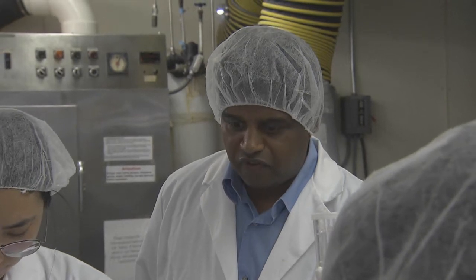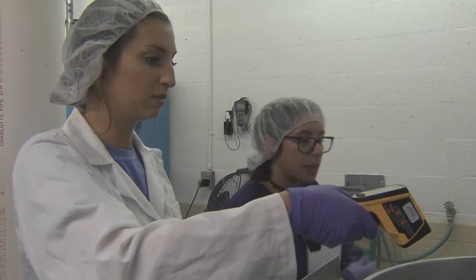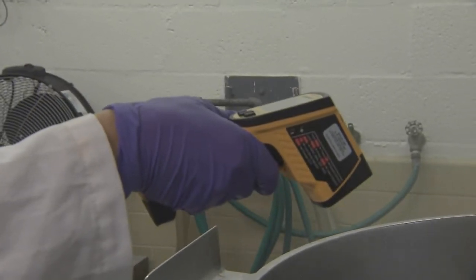Subramaniam Sativala, food processing and engineering professor, teaches the class which he says prepares the students for the workforce. The students work with equipment found in the food industry and use techniques that are employed in the food science profession. Once they learn from here, they can easily adapt to the food industry.